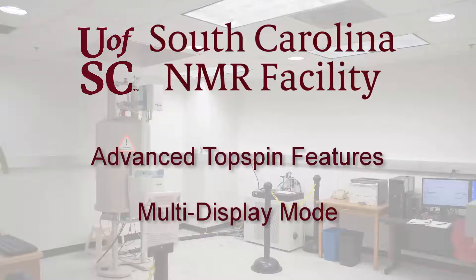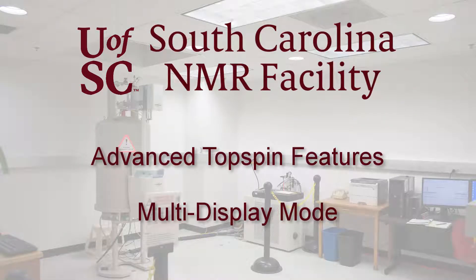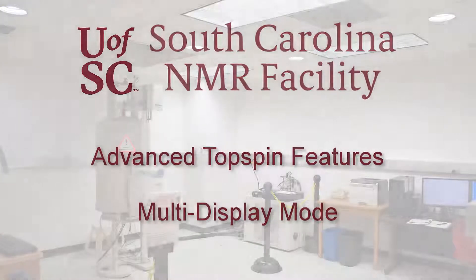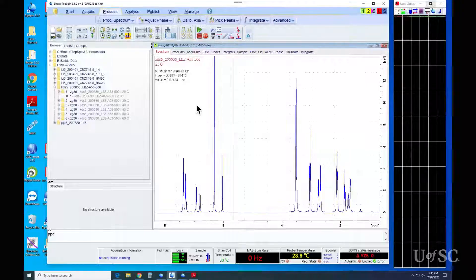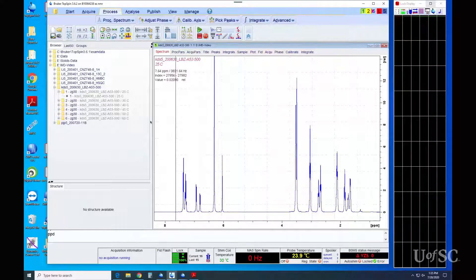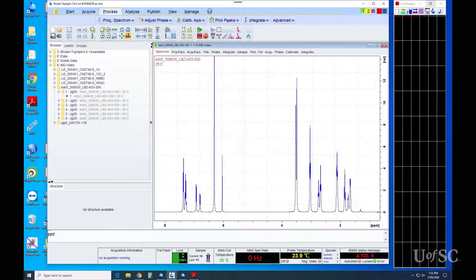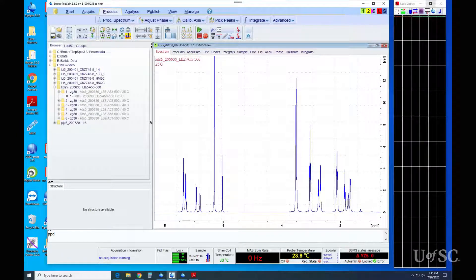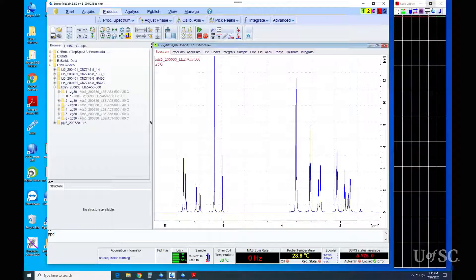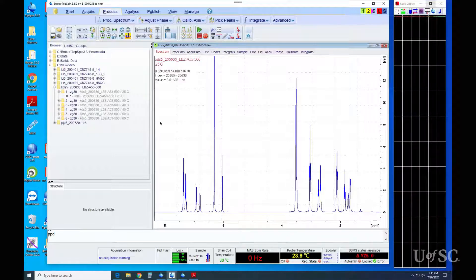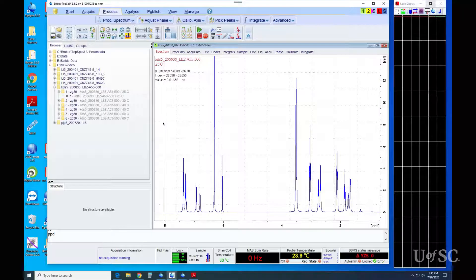In this video on advanced TopSpin features, we are going to explore some functions of the multi-display mode. Multi-display mode allows a user to overlay two or more spectra. It will also allow some simple mathematical manipulations.